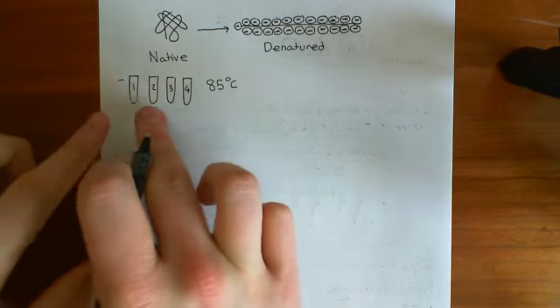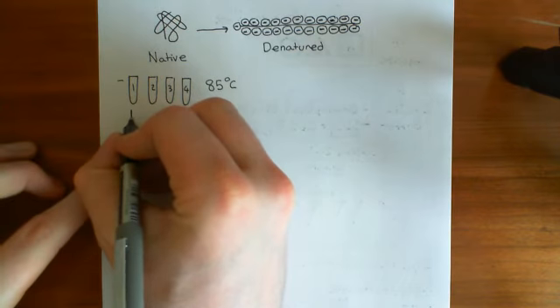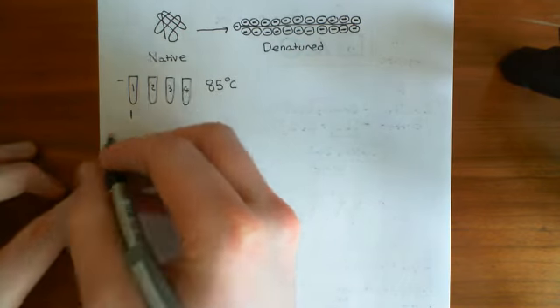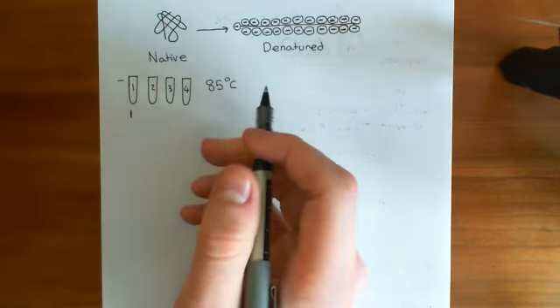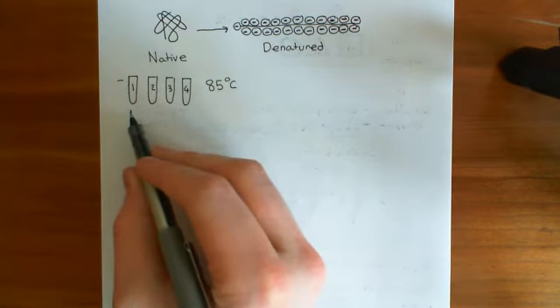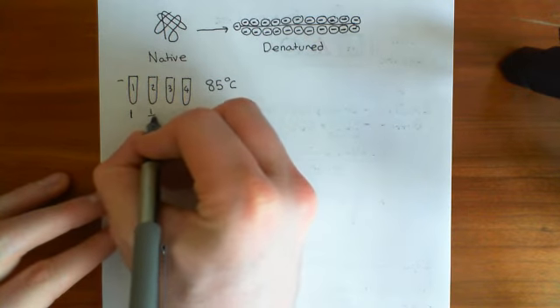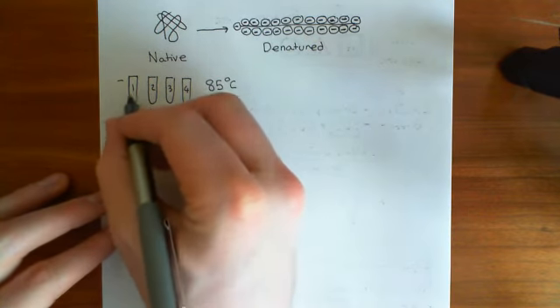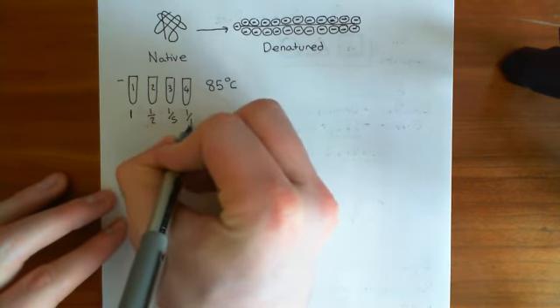So remember, all the difference between these samples is that we're calling this our base standard. So this is concentration 1. Of course, we don't know what its absolute concentration is. We just know what their relative concentrations are. So we'll set this as our standard, basically. So it's just number 1. This one is then a half. So the concentration of protein in this is a half of that one. This one's a fifth, and this one was a tenth.